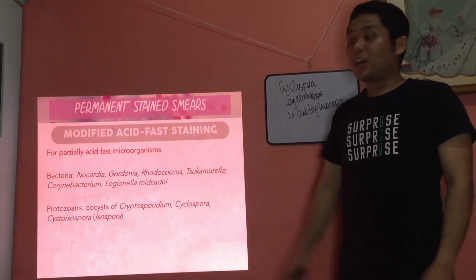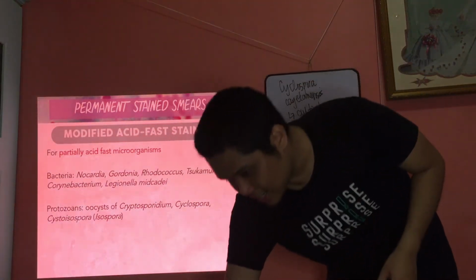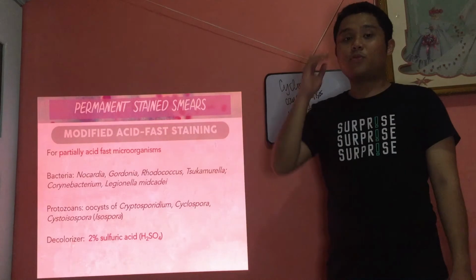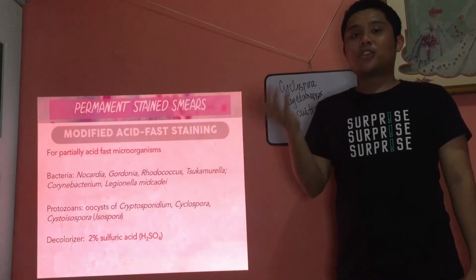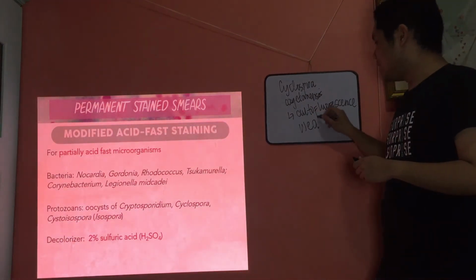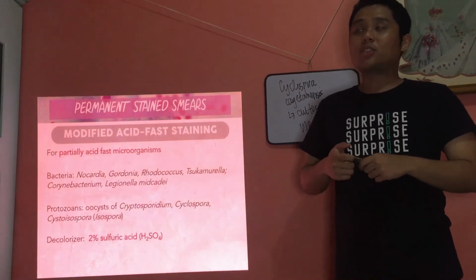So, these are all your partially acid-fast microorganisms, bacteria and parasites. Alright. Now, the decolorizer is, as you can see, 2% sulfuric acid. That's why it's called modified acid-fast. It's because the decolorizer is much weaker. It uses a weaker decolorizer compared to the true acid-fast procedure. That's why it's called modified.